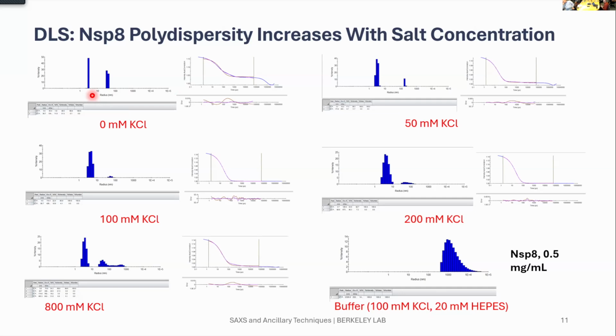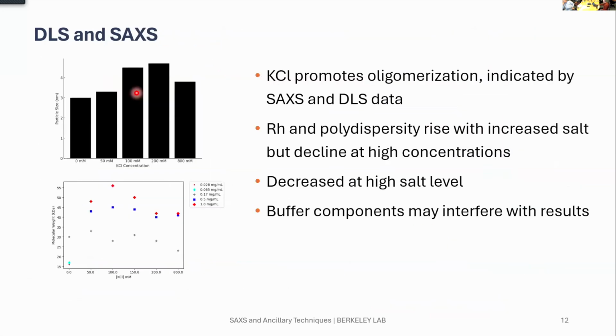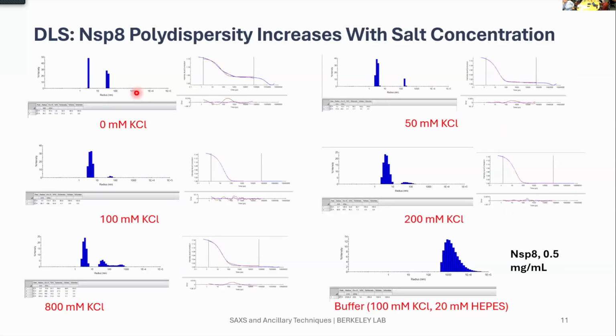So you need to be careful and always check this bigger region where probably we have some effect from other things coming in.